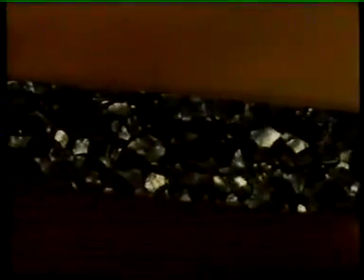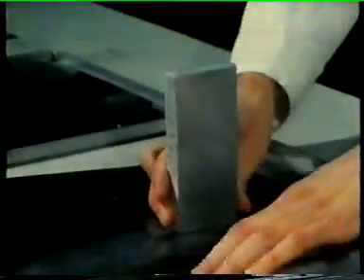All metals are made up of grains, although you'll rarely see them like this. In fact, with most metals, including this piece of aluminium, the grains aren't visible, not even on the surface. Here's a way of making them visible. First, we must give the aluminium a mirror-like finish.